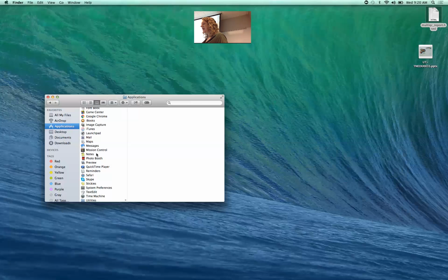So that was my first indication. LT4 might have something weird going on. IC2 might have something weird going on. So anything that doesn't look like the others is usually a red flag.